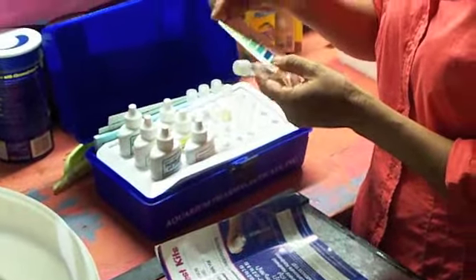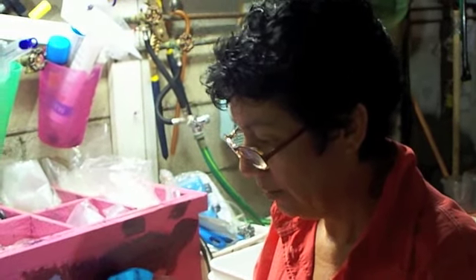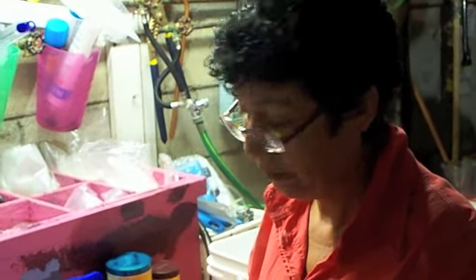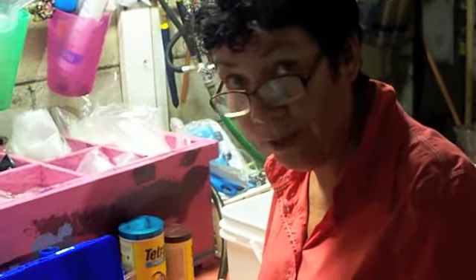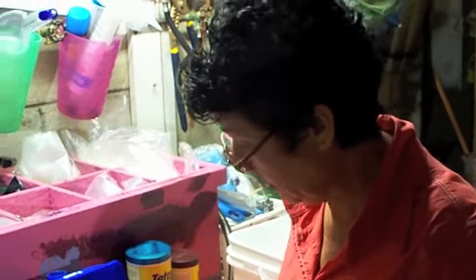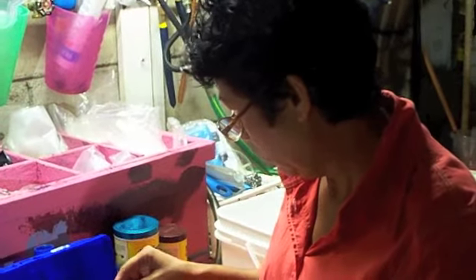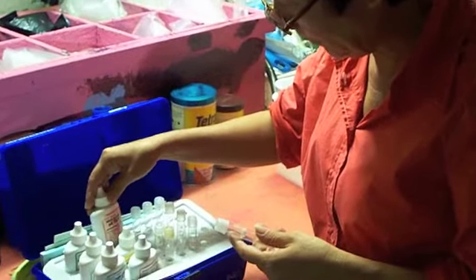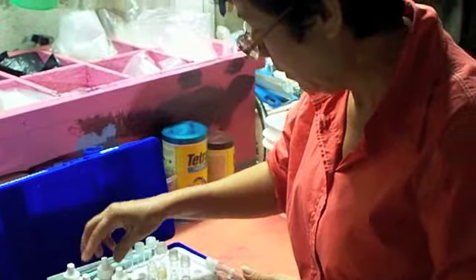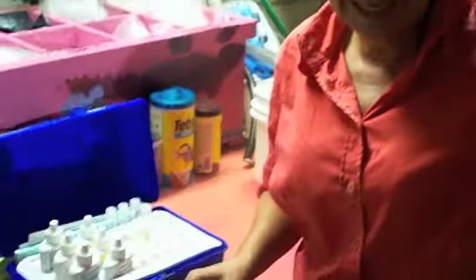What about this one? This is the water phosphate test kit. I don't need this one? Are we testing for phosphate? No, we're testing for copper. Well, is there another thing for testing copper as well? Well, remember how I said we were going to use the pink box? Okay, then what am I going to do now? There's nothing here that I'm going to use. Nothing, just the glass vial. Okay, so put the book back in there.